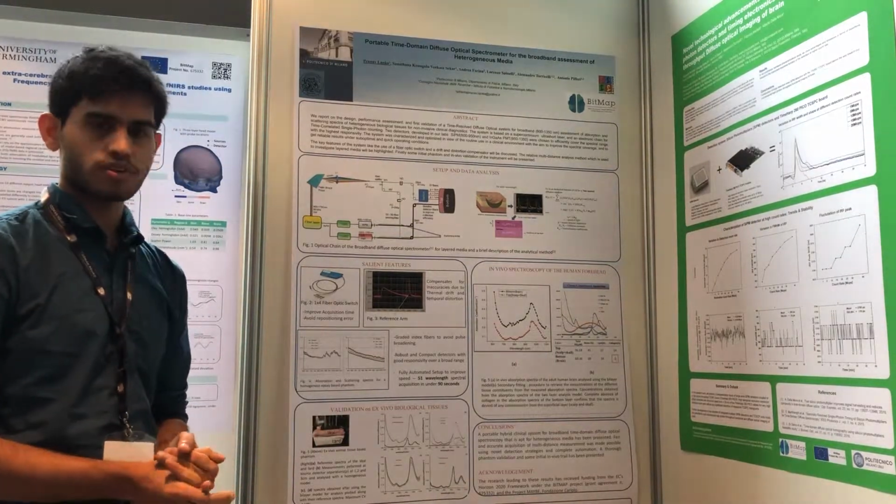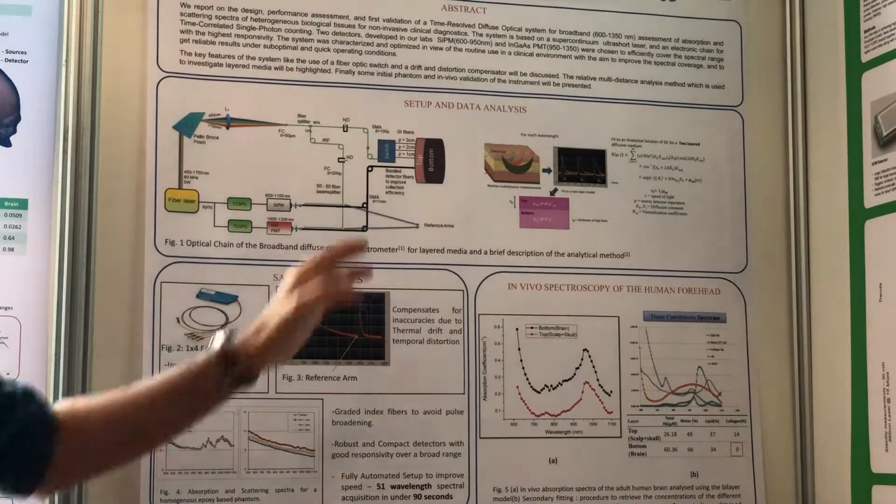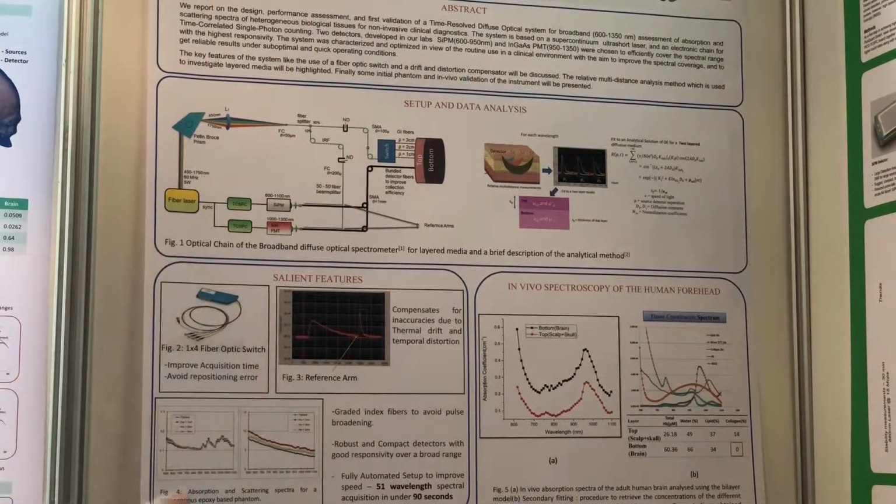A very interesting point with this system is that it's completely automated. Be it the neutral density filters, the rotation of the prism, or the switch. So it's a very well automated system.